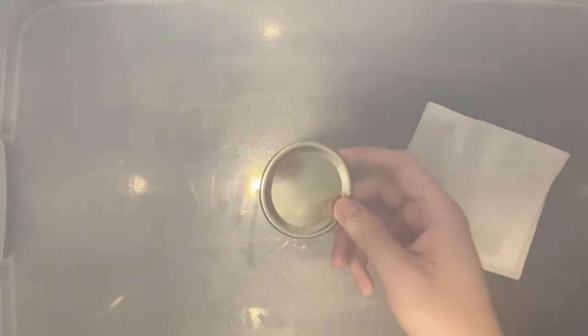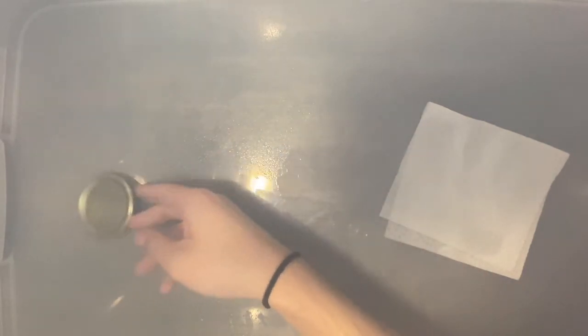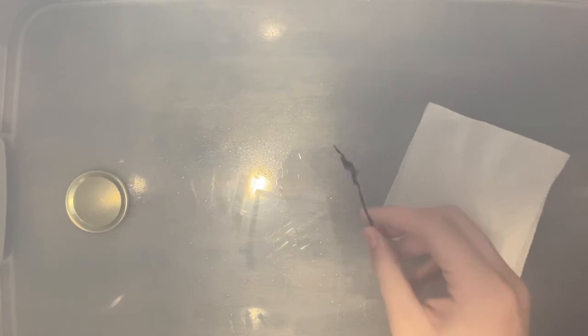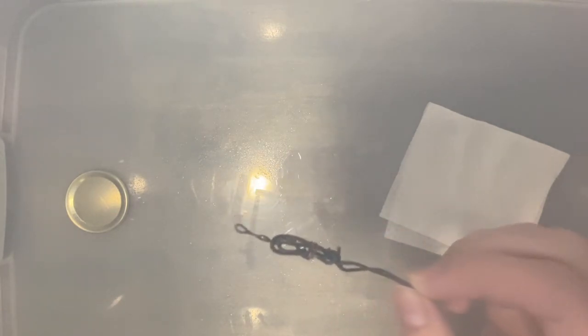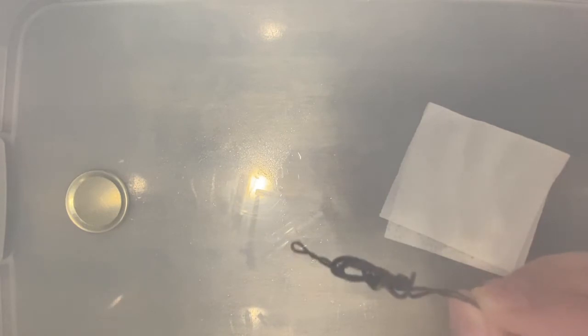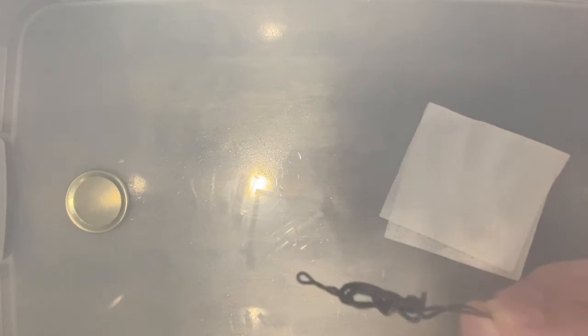So this mason jar is for the multi-spore syringe. This is my ghetto homemade inoculation loop. It's some picture hanging wire and then some copper wire from the inside of an Ethernet cable.